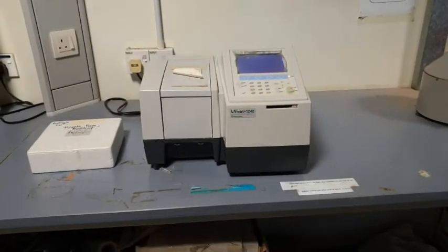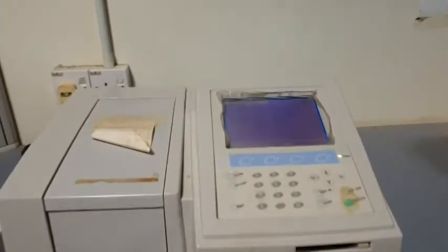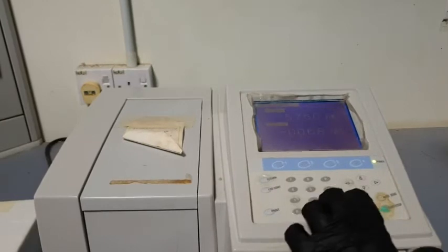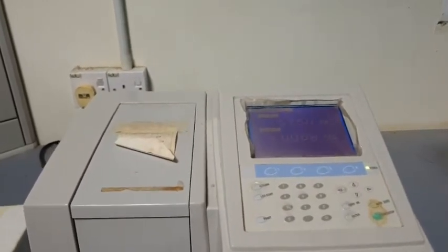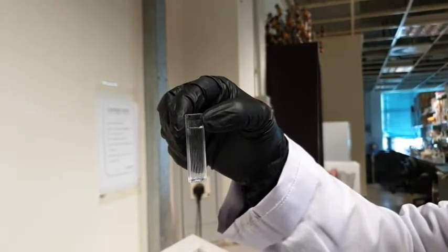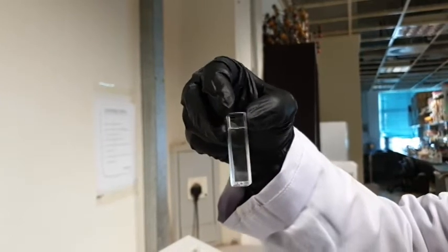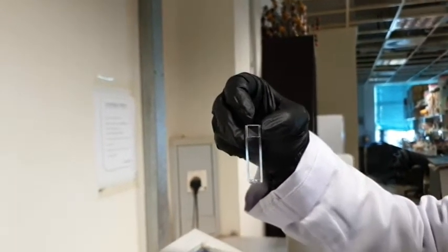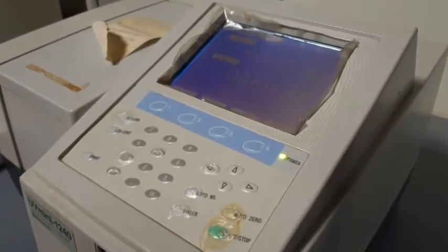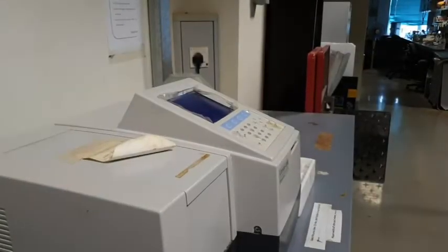A spectrophotometer will be used to measure the yeast growth at 600 nm wavelength. To use a spectrophotometer, firstly, you need to set the desired wavelength. Then, you need to zero the machine by using a blank, which is distilled water. Make sure the clear area of the cuvette is passing the light beam of the spectrophotometer. Press auto zero to change the absorbance to zero.